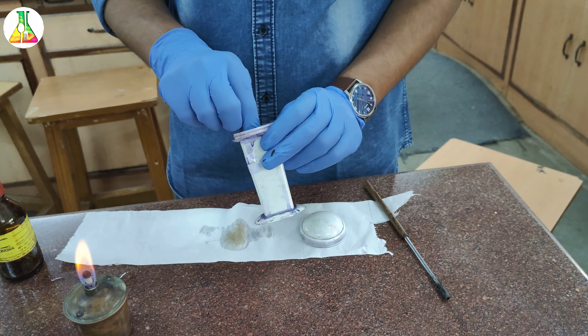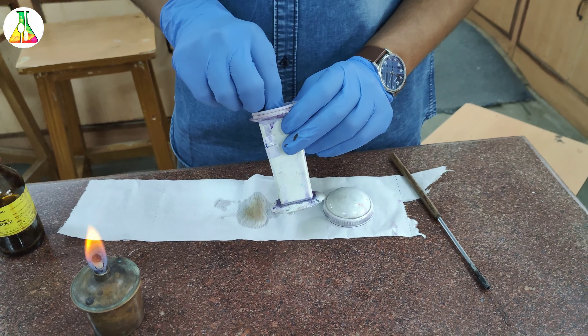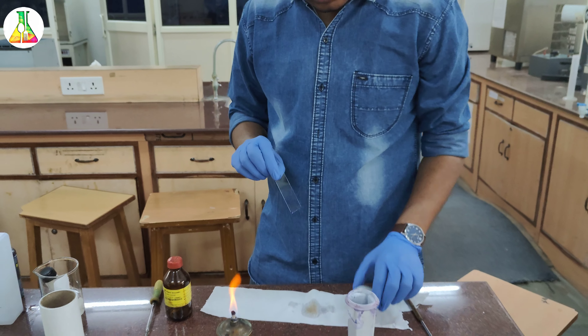Hello everyone, I hope you all are doing well. Today we are going to begin with the Gram's staining. Gram's staining is one of the most important differential staining techniques which differentiates the bacteria on the basis of their cell wall structure.